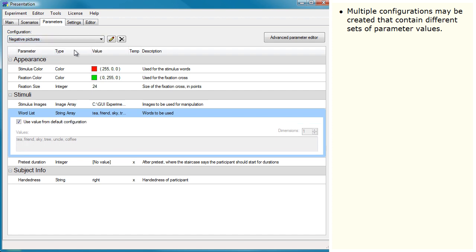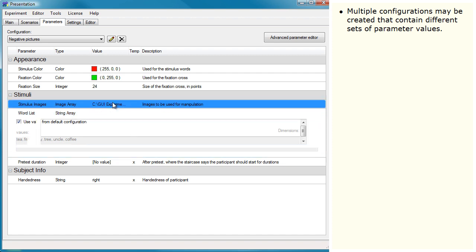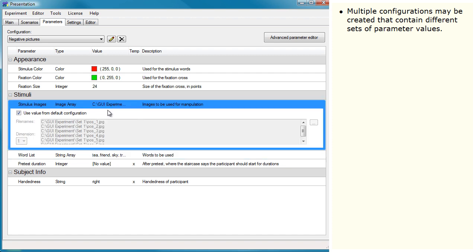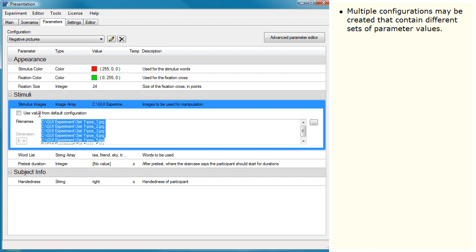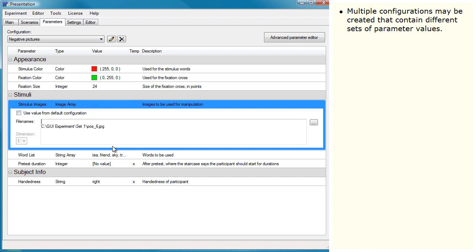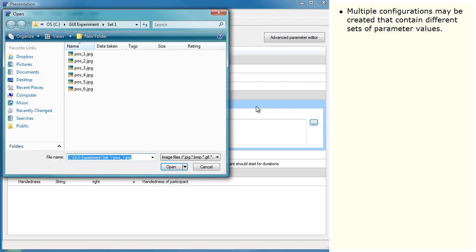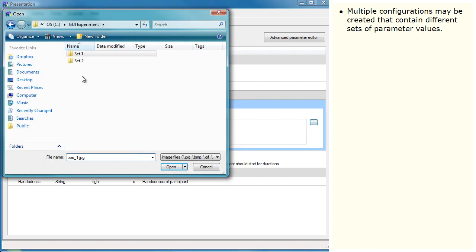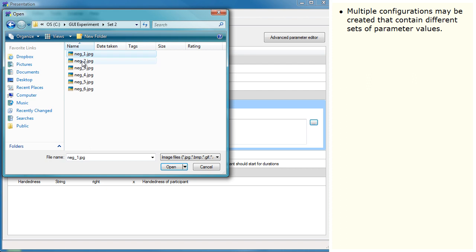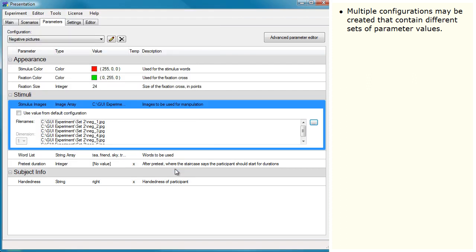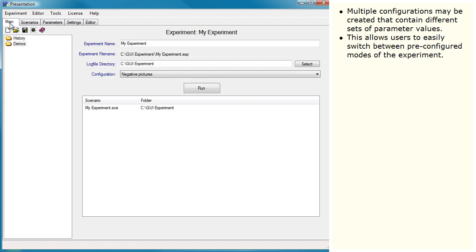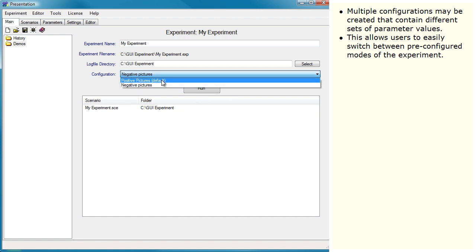Multiple configurations may be created that contain different sets of parameter values. This allows users to easily switch between preconfigured modes of the experiment.